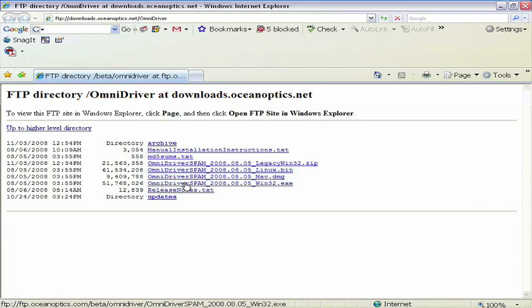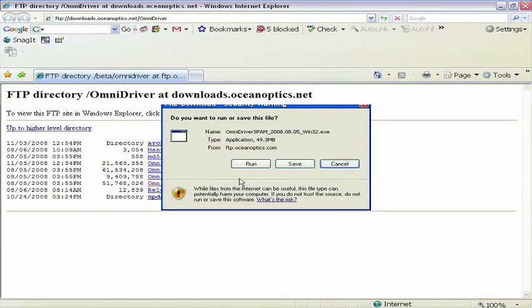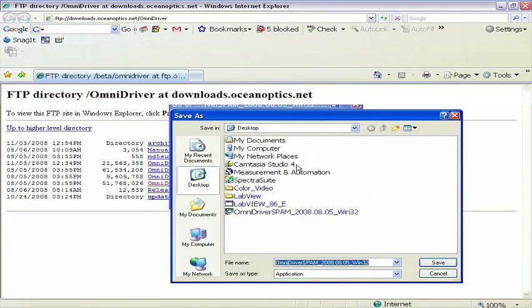In this video, we'll be installing Omni Driver on a Windows computer, so we click on the .exe file extension to download.